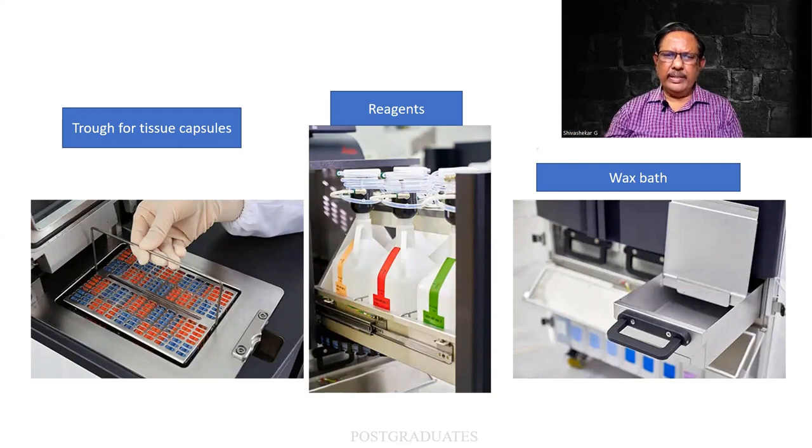After having been placed, these are all the various reagent jars. There will be the provision for this material to go into it. They wait for that particular time, 1 hour or so, after which again there is a provision by which it is drained back into the same jar. Then the next one goes in for action. That is how it proceeds. And this, of course, is a molten wax over here. So I would like you people to kindly appreciate these things.